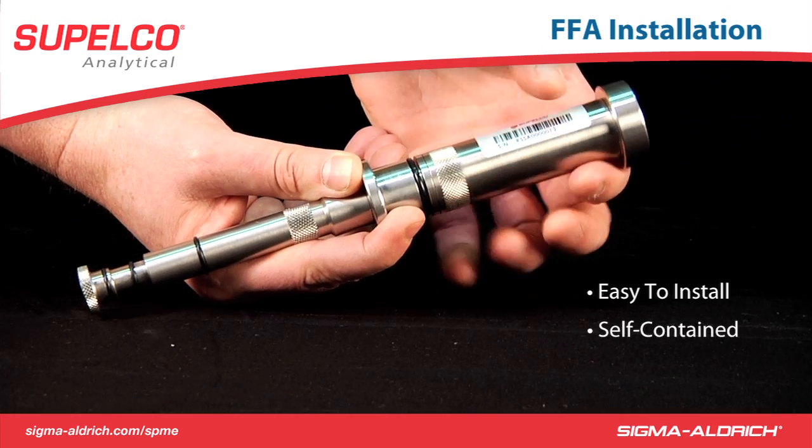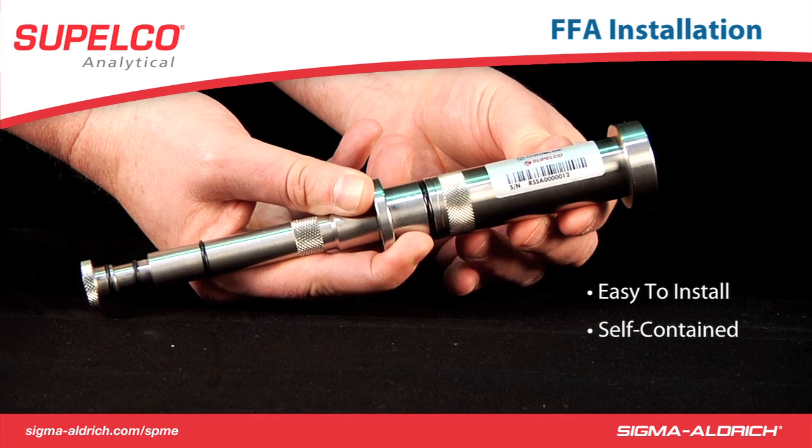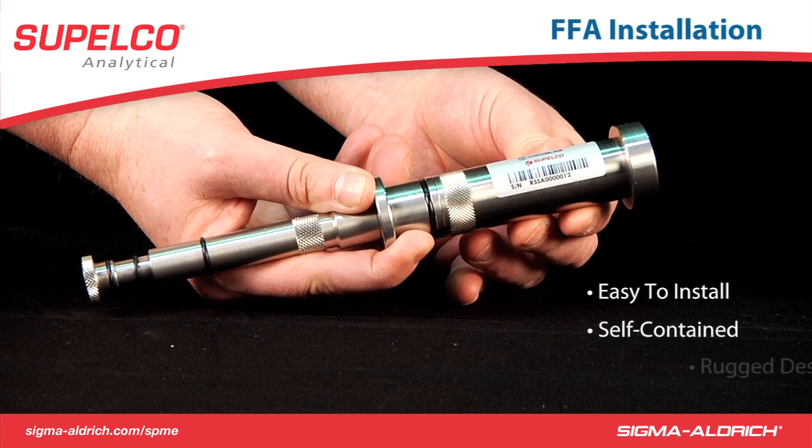The fiber is now safely installed in the field sampler, and the whole sampler is self-contained. The whole unit can be taken to the sampling site without danger of contamination during transport.